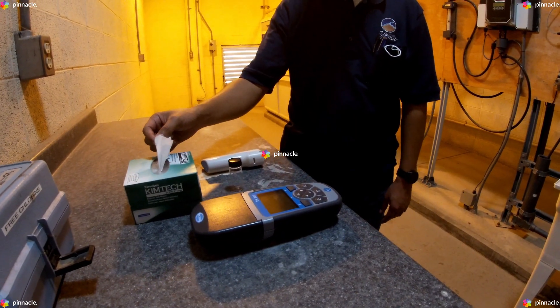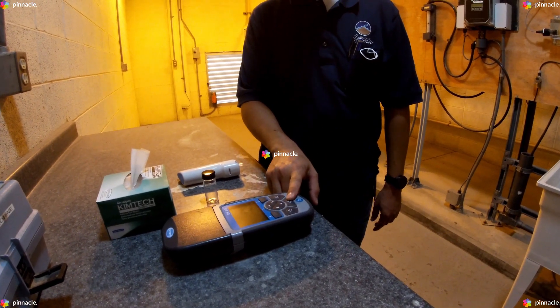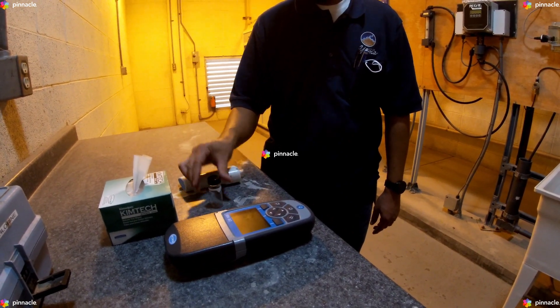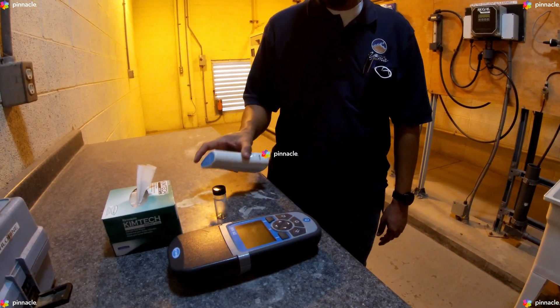For our verification we will be using our DR900 Pocket Colorimeter, one glass sample cell, our DPD free chlorine reagent dispenser, and our paper wipes.